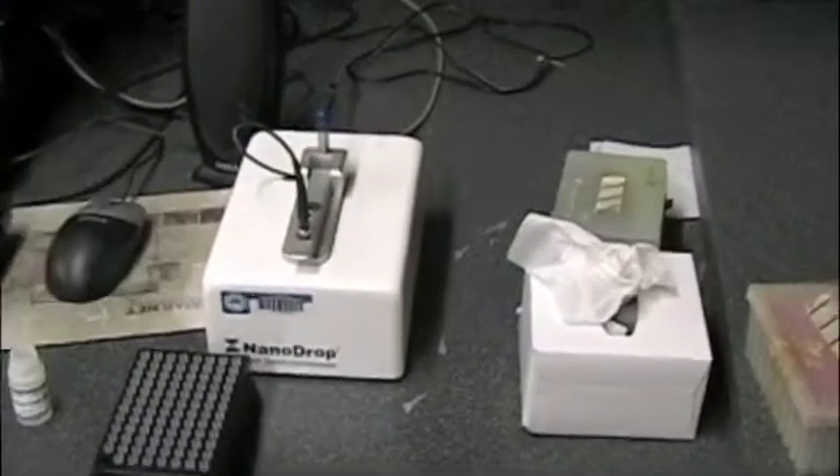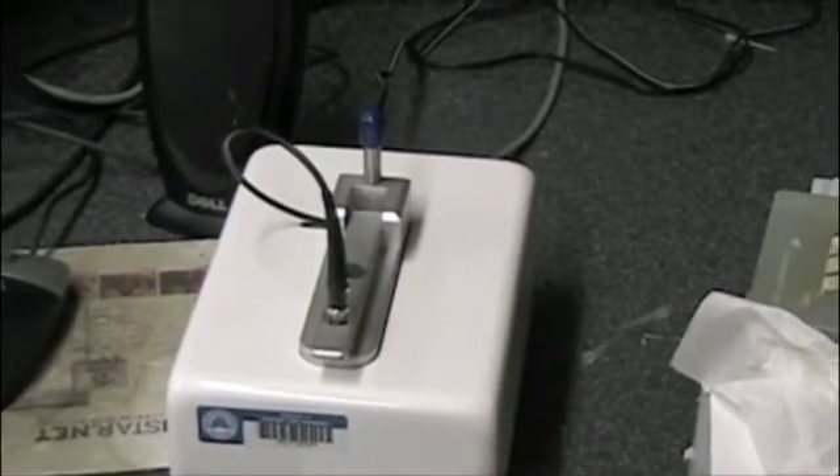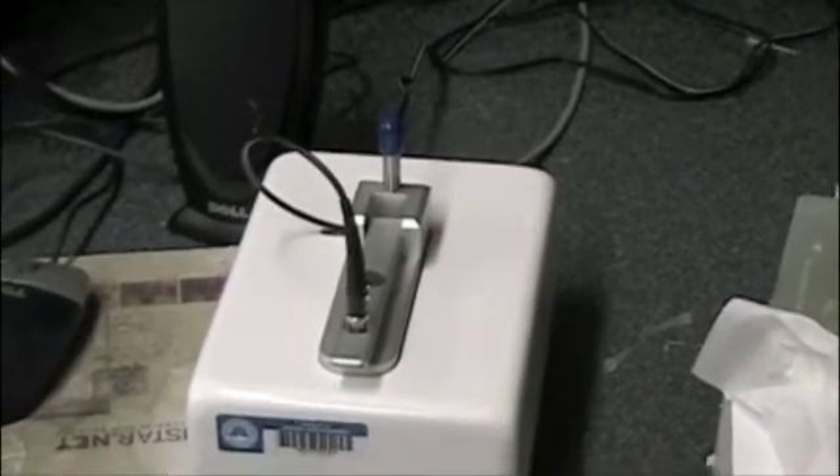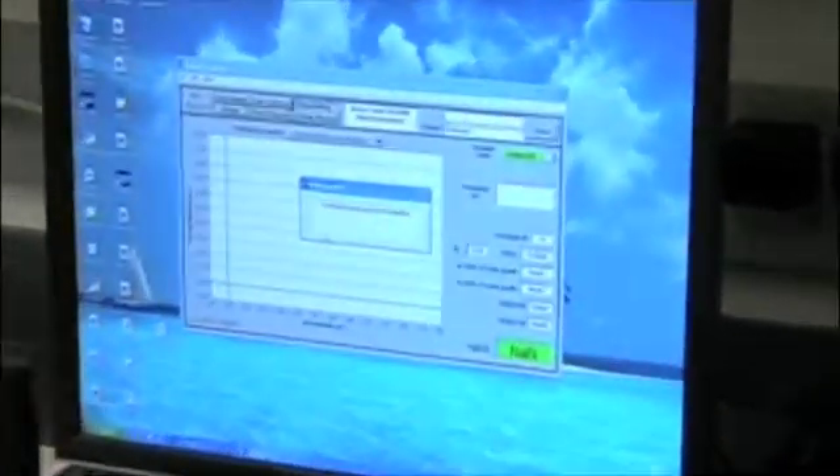That wire coming out of the top is actually a fiber optic cable. It's sending light through there, and in the bottom there's the reader which measures the absorbance of light coming through there, or diffraction, for the DNA. On the machine, we confirm okay, so we have our water loaded.